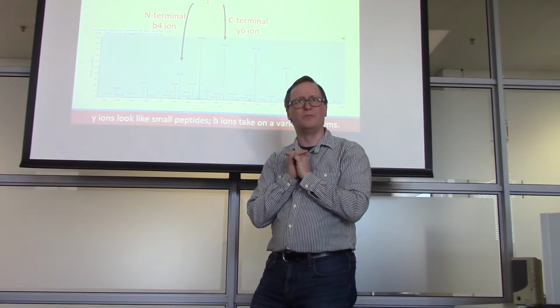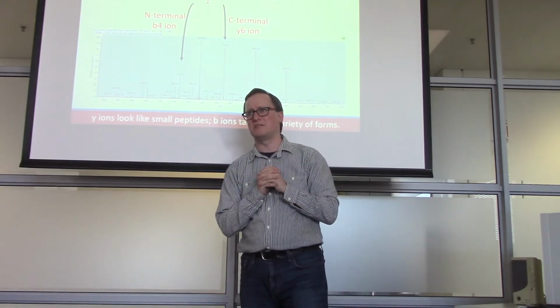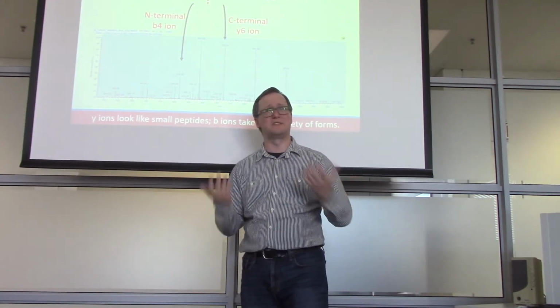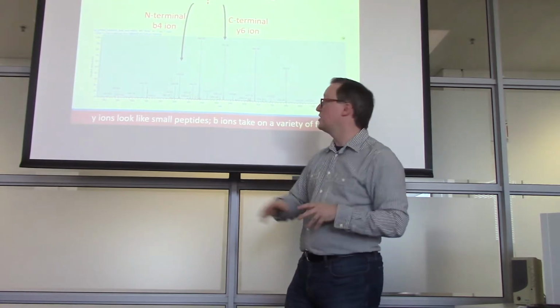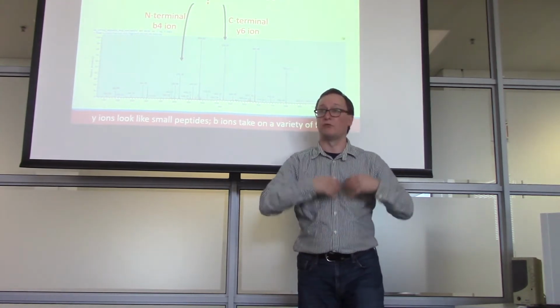It's hard to do. I took a semester-long class devoted to teaching us to interpret these tandem mass spectra, and I would say it is difficult to interpret and to infer an entire peptide sequence from almost any tandem mass spectrum, even the very beautiful ones that we produce now with high-resolution measurement. So, while this can give us good clues about the sequence, it is hard to just read a sequence from one.